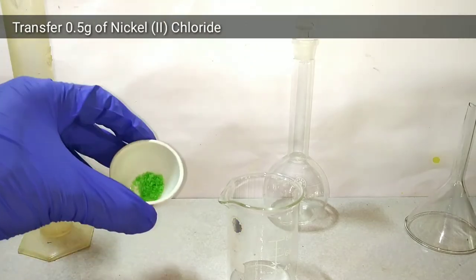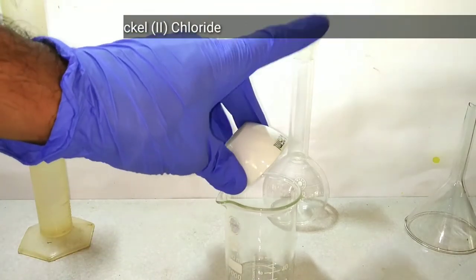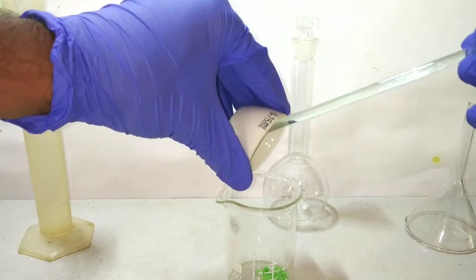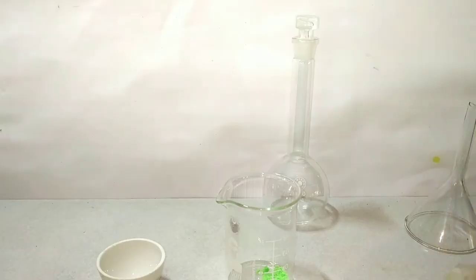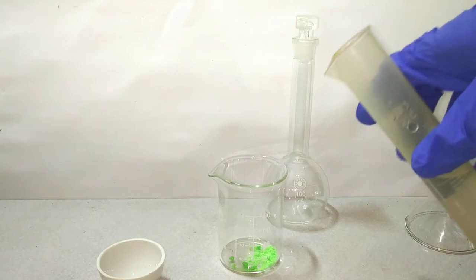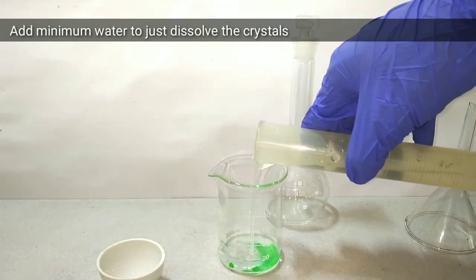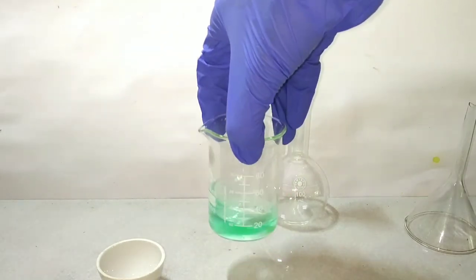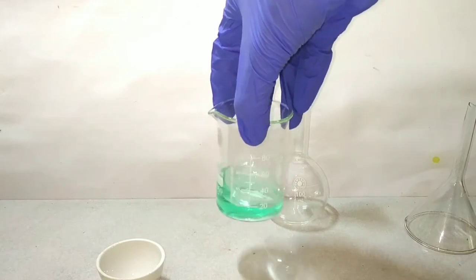First of all, transfer 0.5 grams of pre-measured nickel chloride into a clean and dry 100 milliliter beaker. Keep aside that glass rod and dish because we will be needing them later. Now add minimum amount of distilled water just to dissolve the crystals. Nickel 2 chloride, being a transition metal salt, has a green color due to partially filled D subshell.